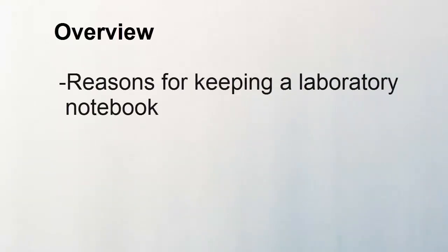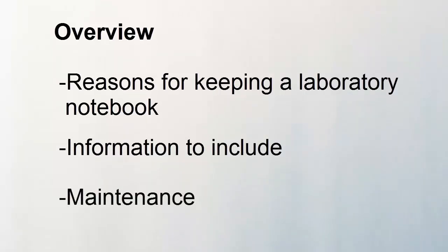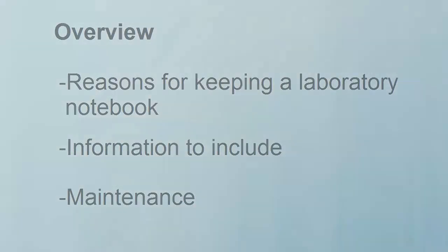To achieve this objective, we will focus on three main areas. First, we'll look at some of the reasons for why we even keep laboratory notebooks. We will then move on to talk about some of the information that should be included in a lab notebook, and then we'll finish up with some maintenance issues in terms of securing your laboratory notebook and proper witnessing of a laboratory notebook.